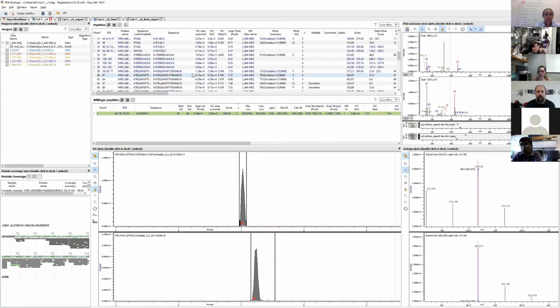table. Okay. Finally, once all that's done, what we're going to do is add the XICs from the missing samples, from the MS1 only samples. And that's a single click thing.